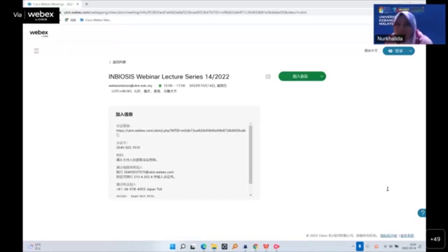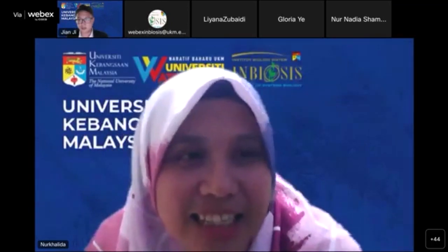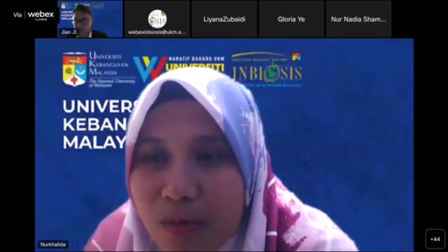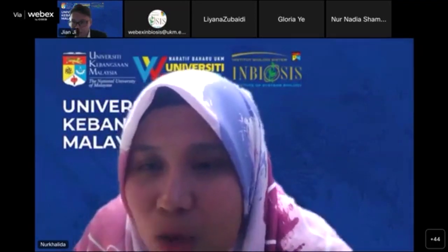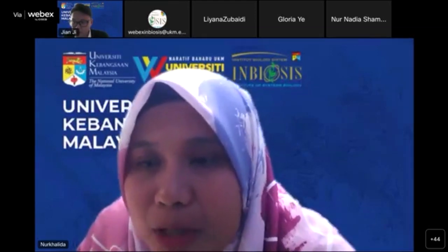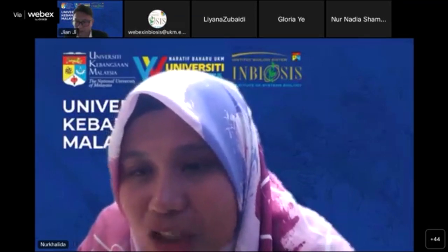Before I ask my question, we have one question from Dr. Tan Jan Kit from UKM. Very informative talk. The question is, if we have a limited budget and can only choose one platform, which platform, LC or GC, do you recommend for detecting human primary polar metabolites in an untargeted approach, without considering dietary carbohydrate, in which GC outperforms LC as you mentioned?